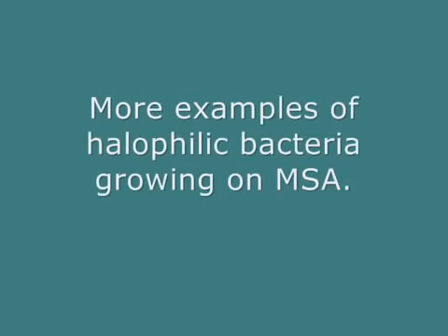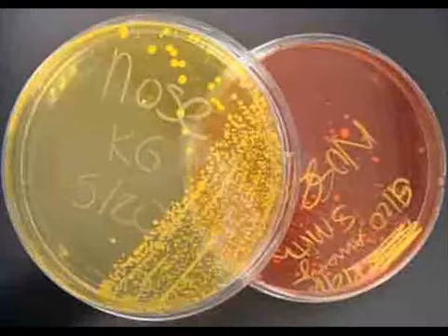Here are some more examples of halophilic salt-loving bacteria growing on mannitol salt agar. Here are two nasal samples plated on mannitol salt agar. Let's first examine the plate on the left. There is growth, so we know these are halophilic bacteria.